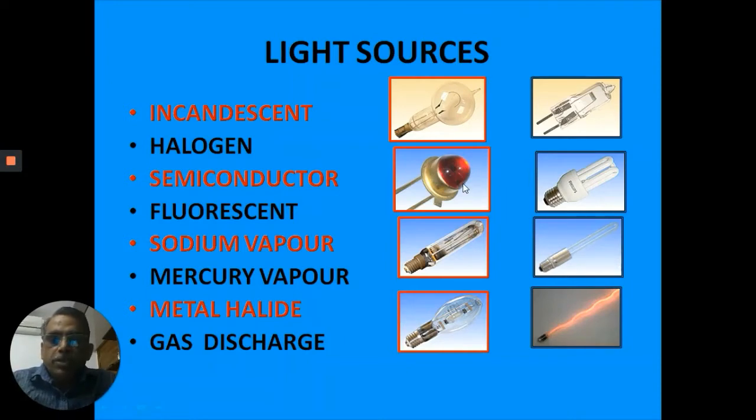And we have the semiconductor light sources. They are nothing but the LEDs, light emitting diodes. They have a wide coverage of visible and white light and UV also. The other one is the fluorescent light. Fluorescent lights have different formats: tube lights and compact fluorescent lights, CFLs. Presently we are moving towards LED technology, white light LED technology, for domestic applications, street light applications and so on.